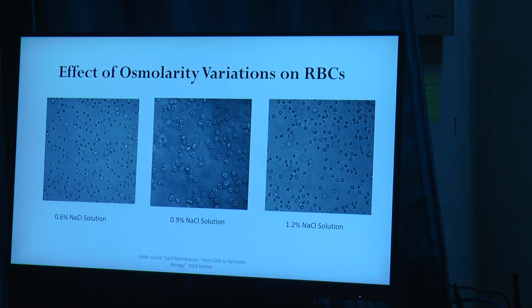And when we do that, red blood cells are going to bloat, because normal red blood cells are disc in shape, but when you put them in hypotonic solution conditions, they are going to bloat and take the shape of spherocytes. They are called spherocytes because they are spherical in shape.